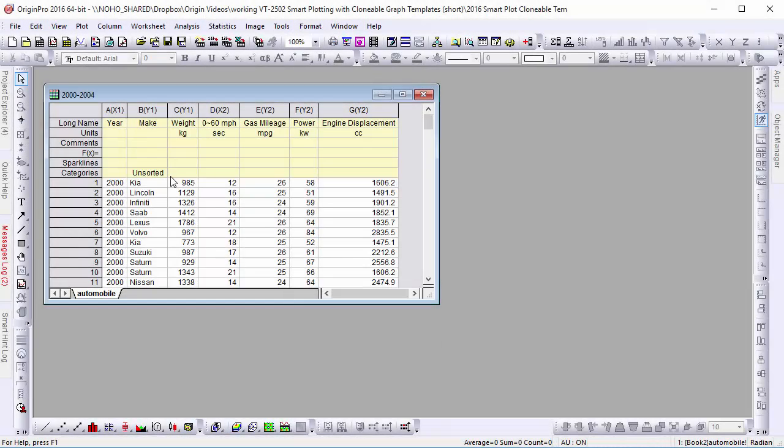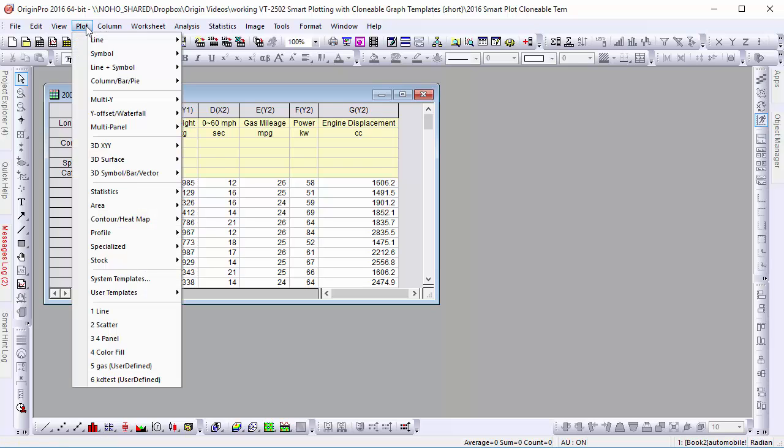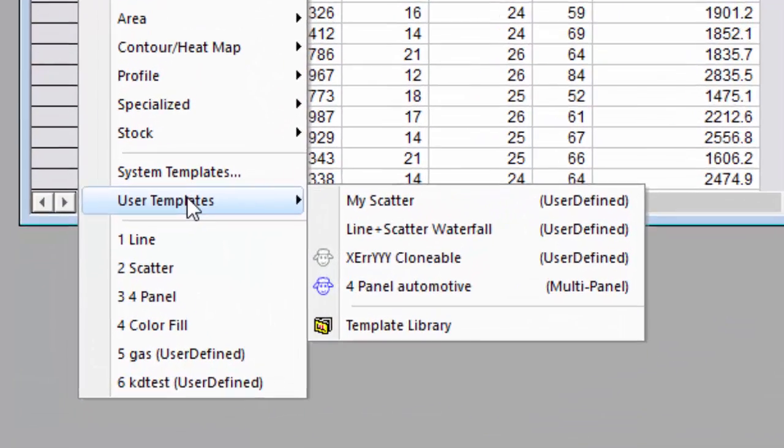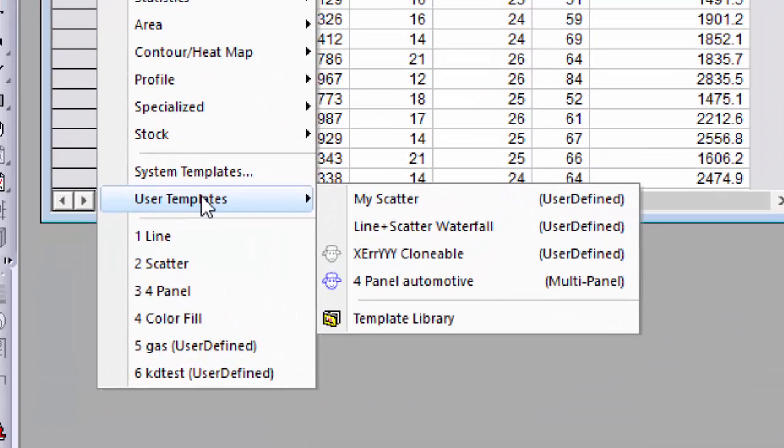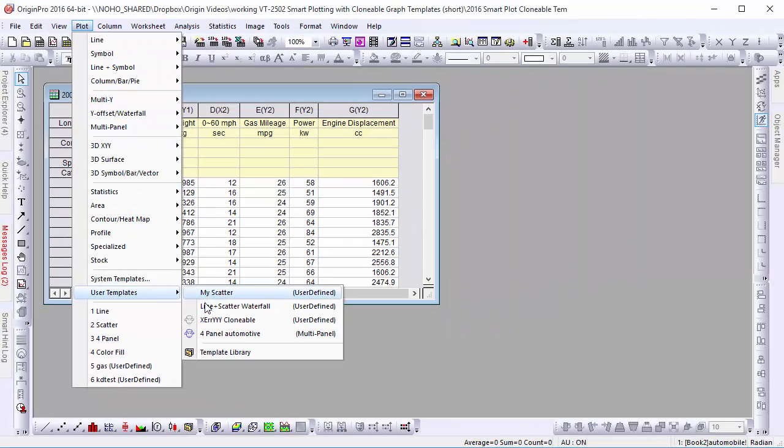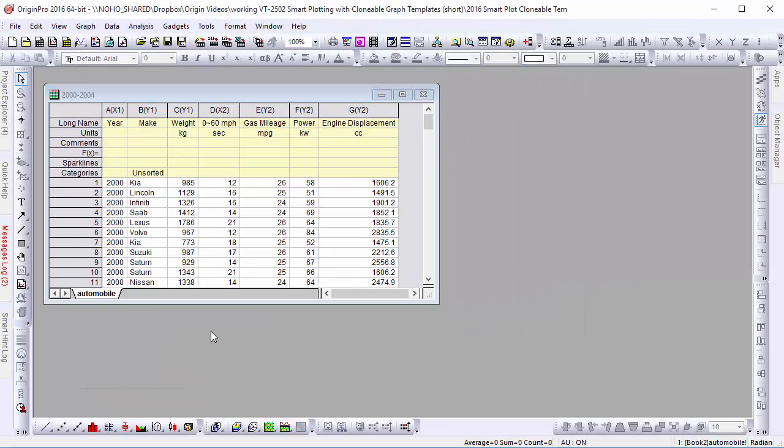When we go to our User Templates from the Plot menu, we can see a list of the graph templates we've previously created. Clonable templates are denoted by little sheep's head icons. OriginLab calls it Smart Plotting because Origin knows which of the Clonable Templates will work with the current data set. Those that can't have blue sheep's heads. Let's select our Clonable Template and take a look at the graph that is created.